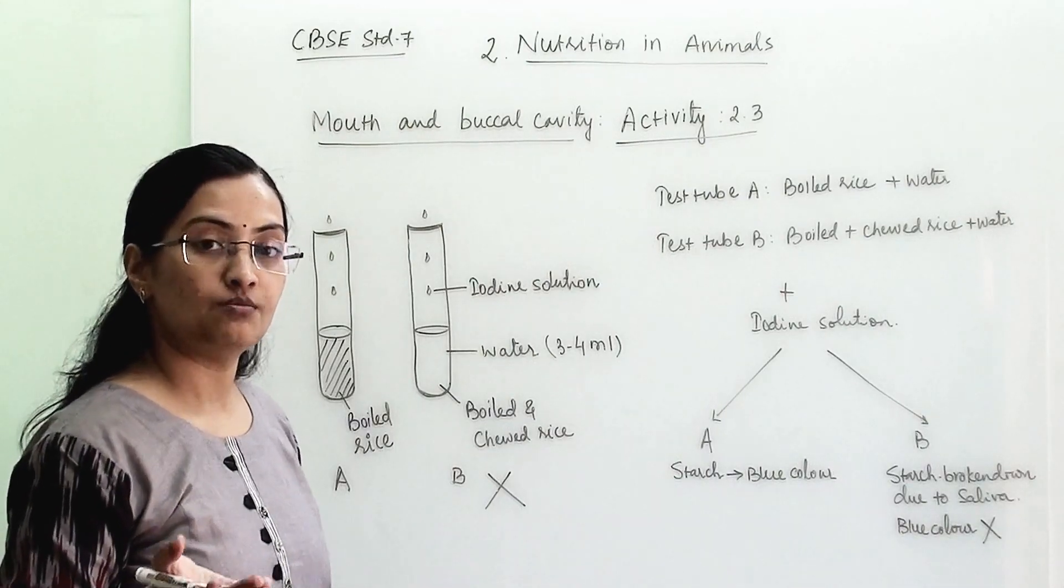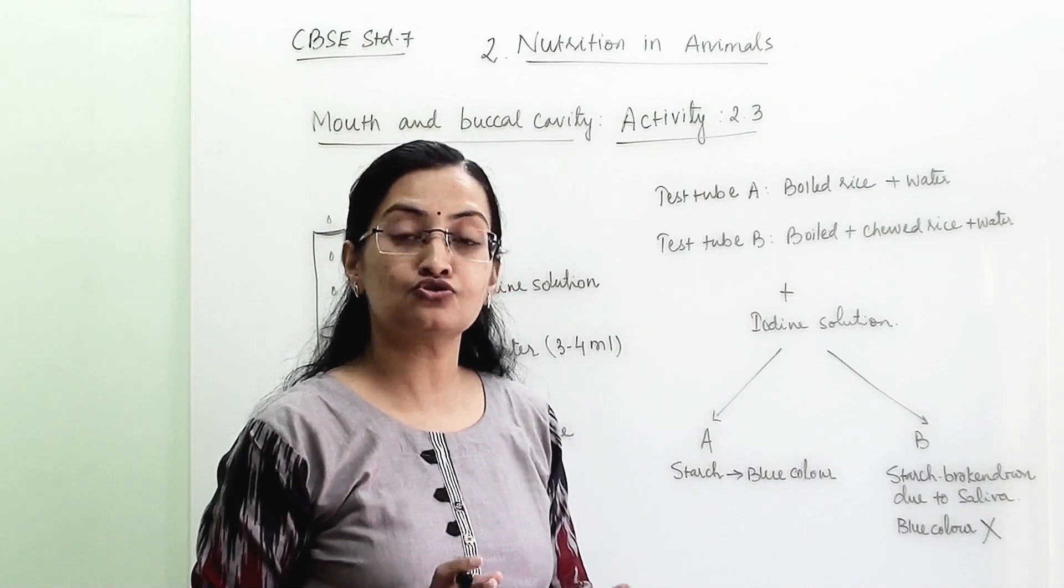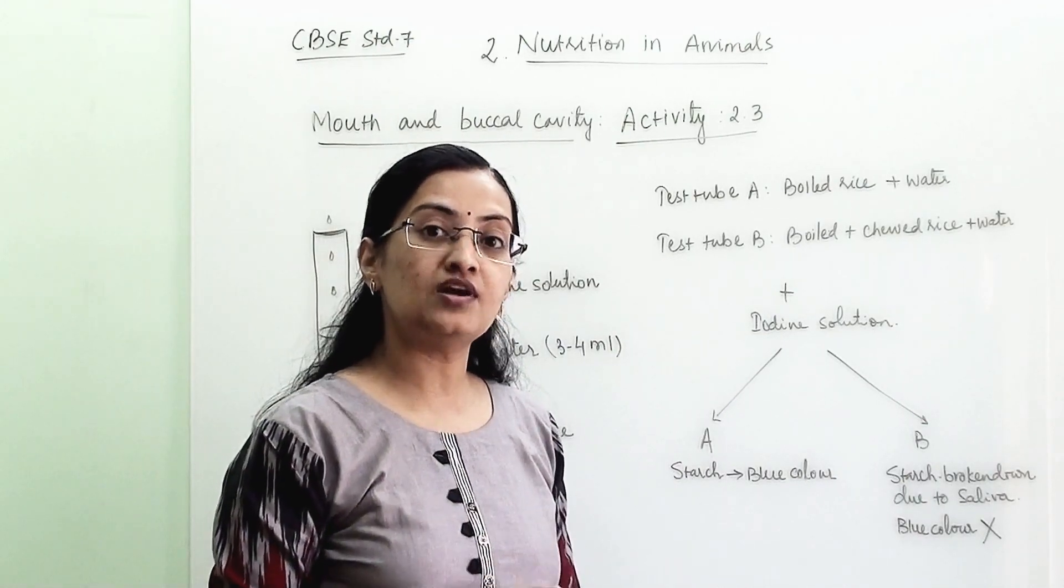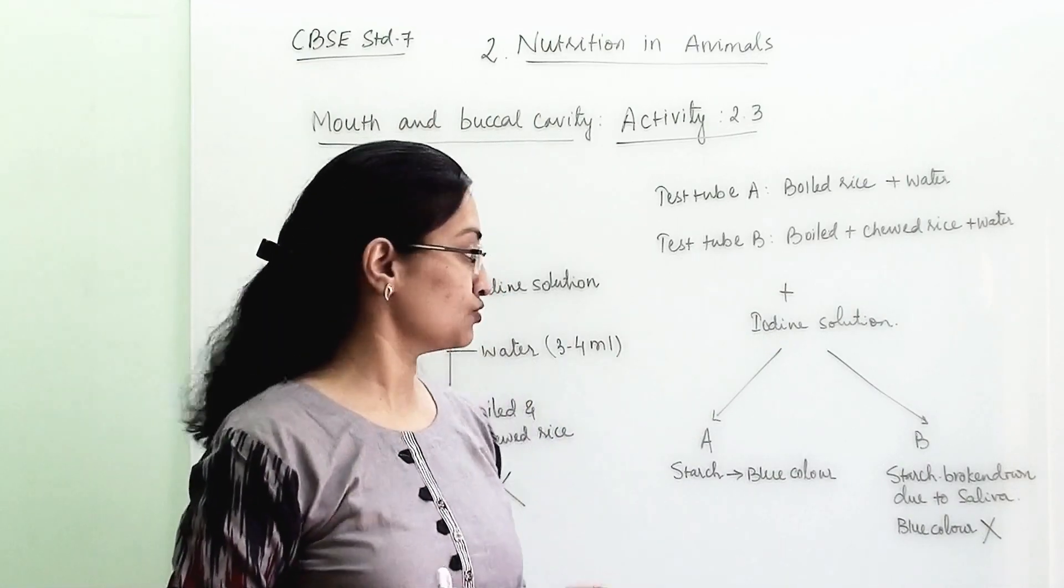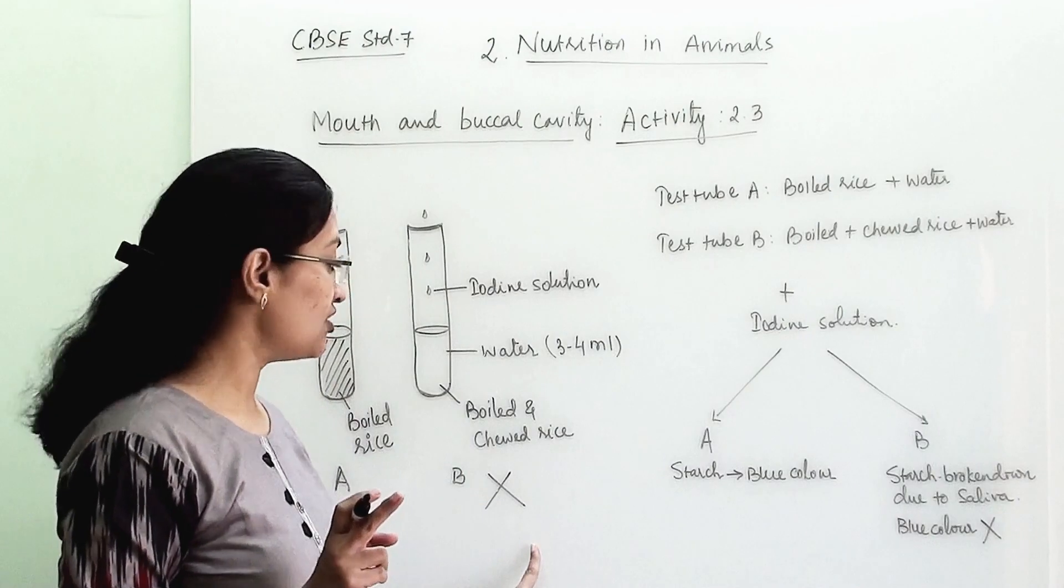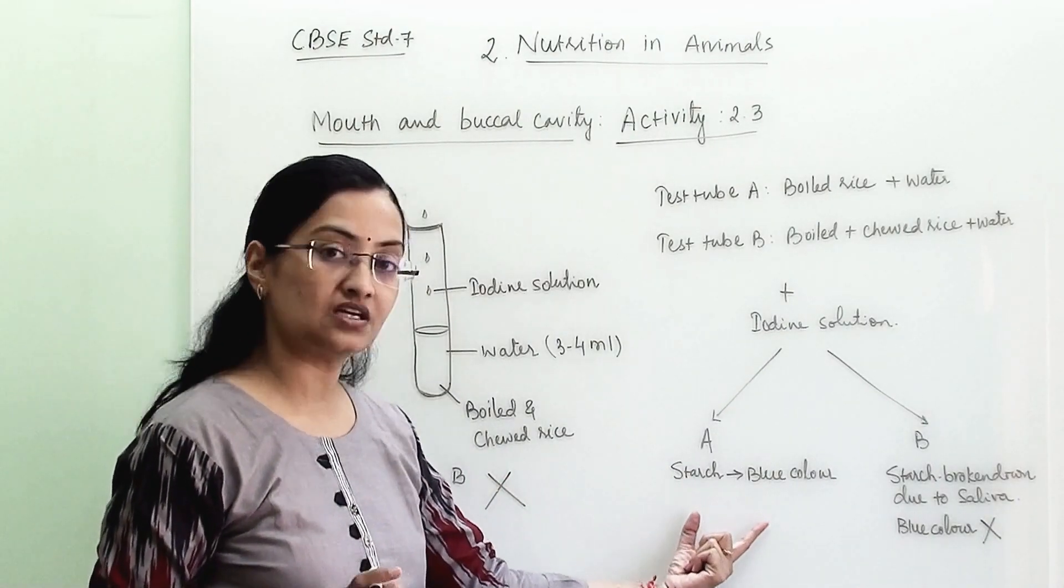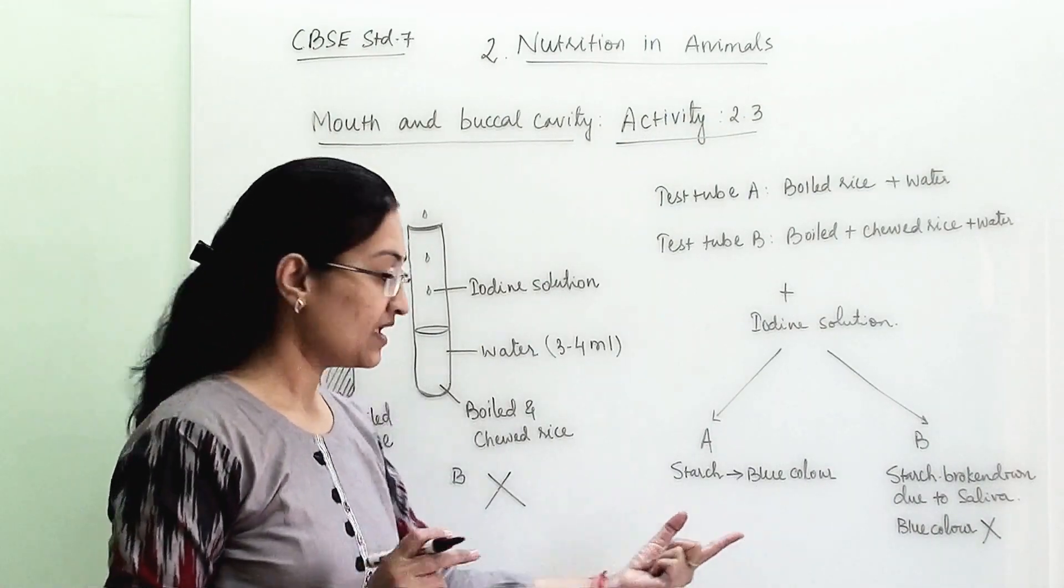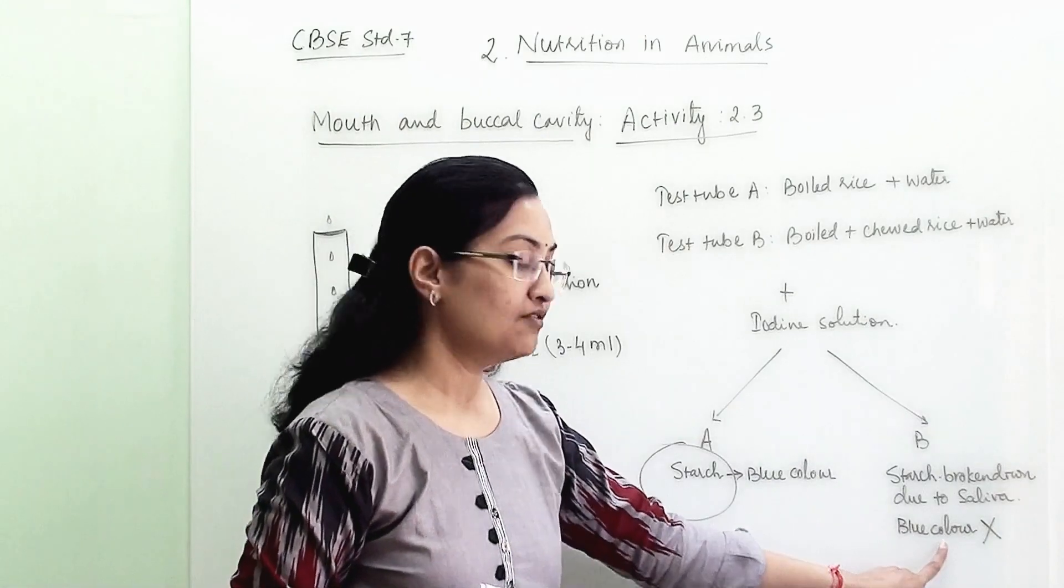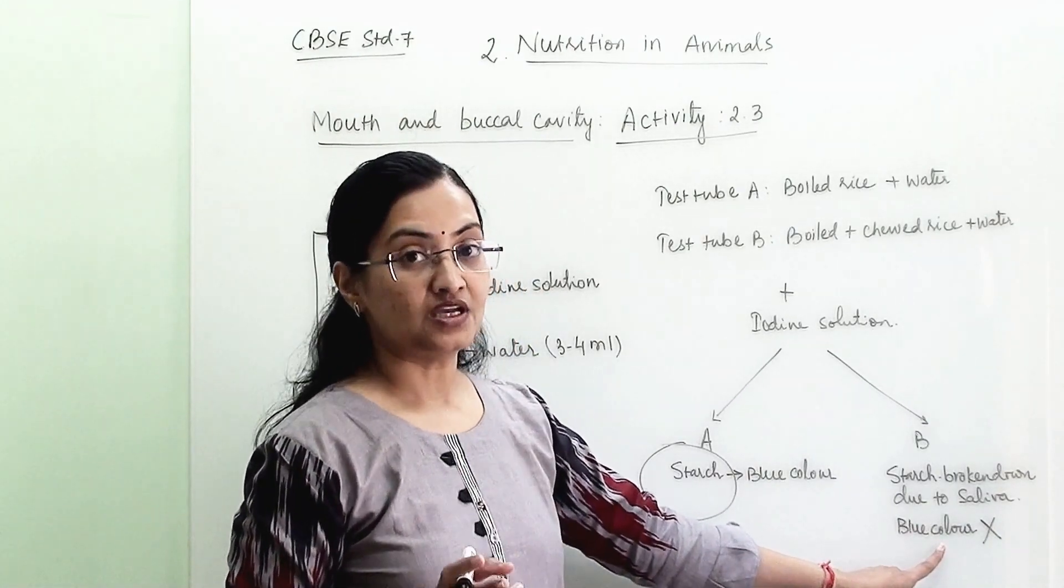Whatever starch is there in the chewed rice has been converted into simple sugar because our saliva, which is one type of enzyme, is also known as salivary amylase. That has converted starch into simple sugar. So there is no starch in test tube B. We will not be able to see any color change in test tube B, whereas we will be able to see the color change in test tube A, in which we can see the presence of starch.